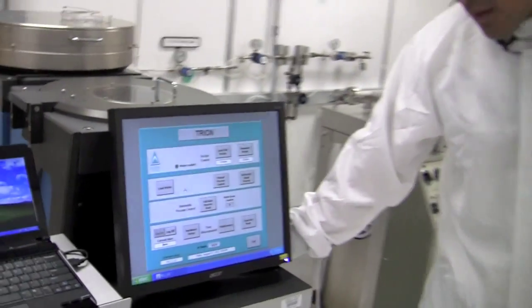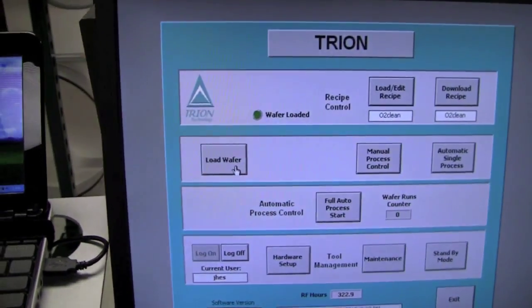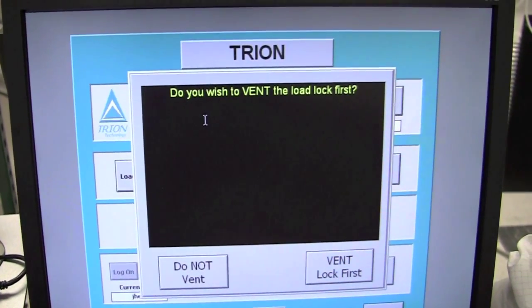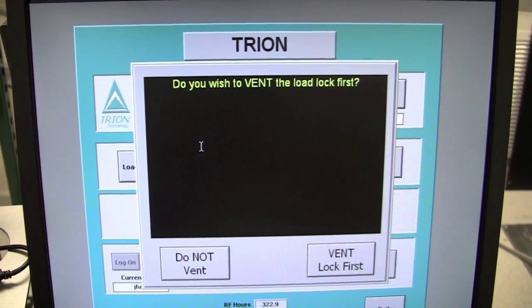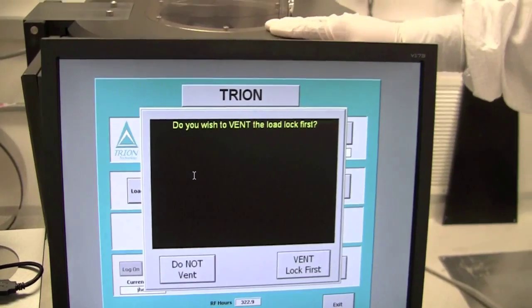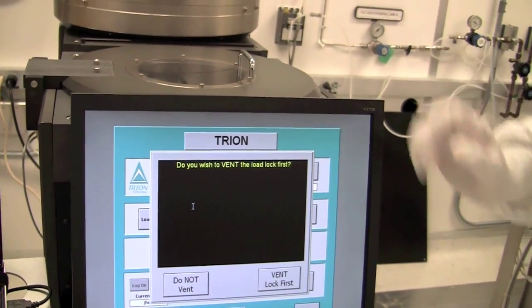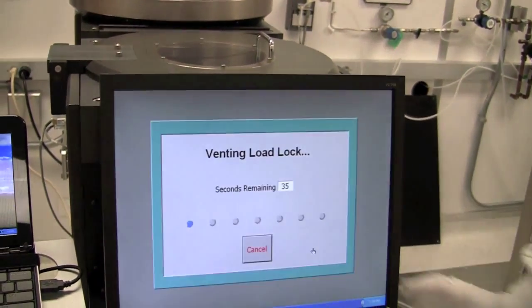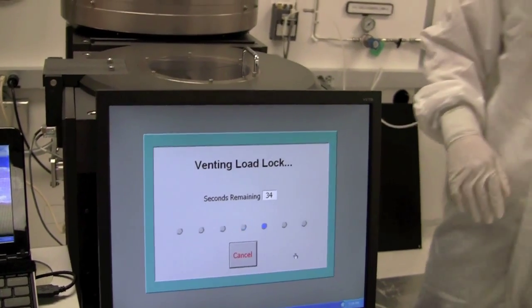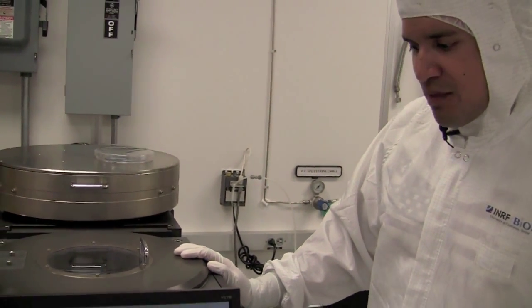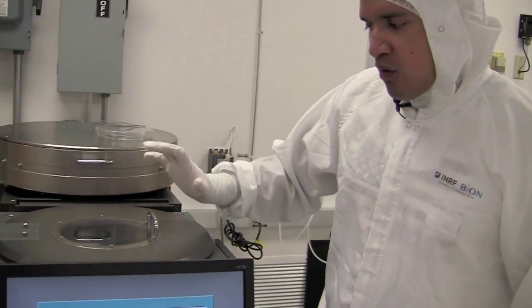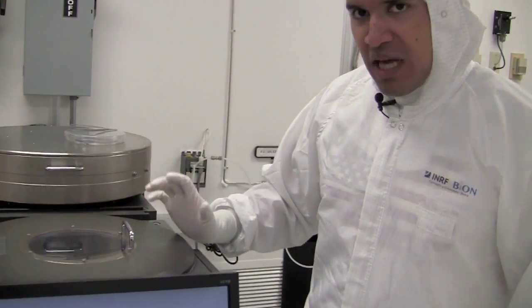So, once we know that there's no sample already loaded, we can load our sample. So, to do that, we click load wafer on the screen. It will ask you, do you wish to vent the load lock? So, by vent, it means it's going to put nitrogen in here to allow you to open the vent. So, yes, you want to vent it. You're going to hear some noises. It takes about half a minute and then this will slowly come up to atmospheric pressure.